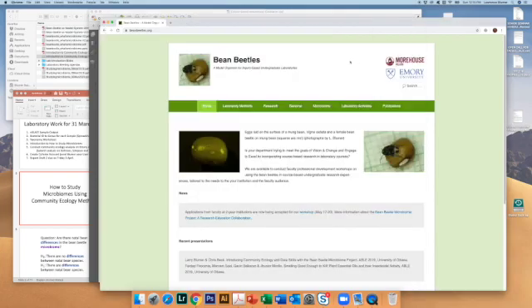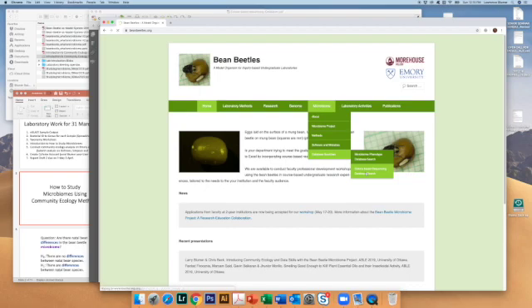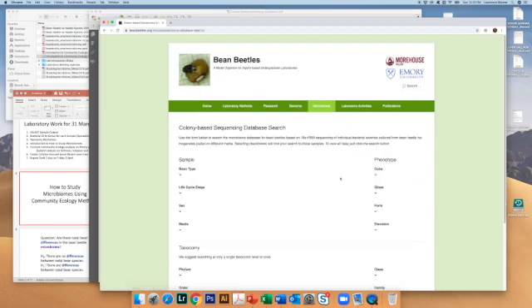That's here. By the way, your instructor may have already pulled data down for you and made those data available, but if they didn't, you can go to microbiome database search and colony sequence database search. And then you have a number of choices. The choices that you make are going to depend on the kind of experiment that you were already doing.